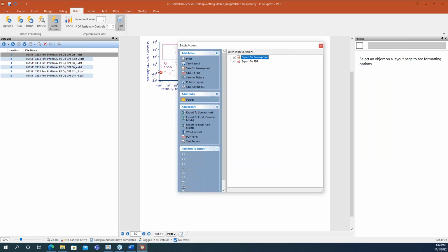Good, perfect. Now with our Excel sheets, we've now introduced the ability to do an internal spreadsheet. This can be fantastic if we're doing comparative work. We need to report out our information for all of these samples, maybe even introducing some of those charts, the bar charts or pie charts. Remember, I had told you before that one of the things that deactivates your iterations here is a spreadsheet. So using this option to use an internal spreadsheet and having the software create it for us will eliminate that as an issue. We'll be able to create a spreadsheet here and then create those charting tools as well.